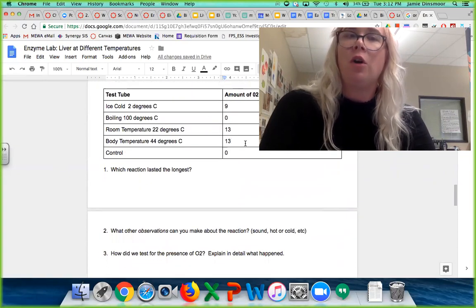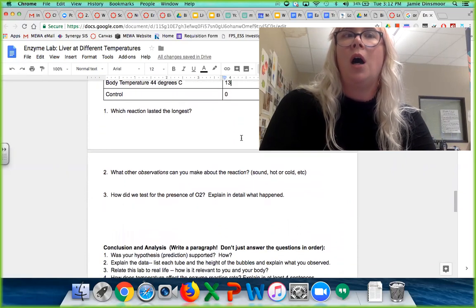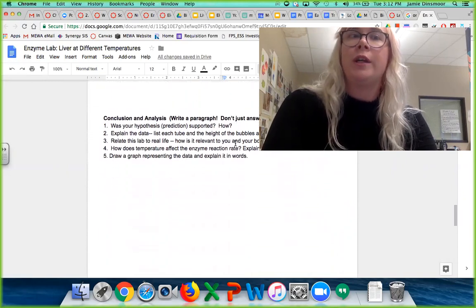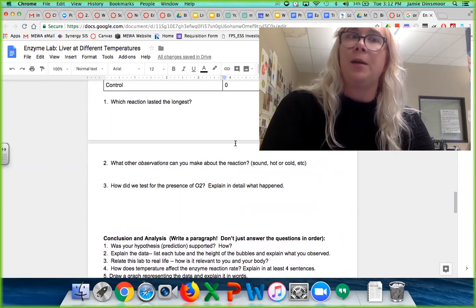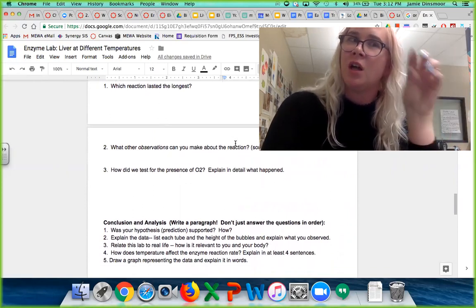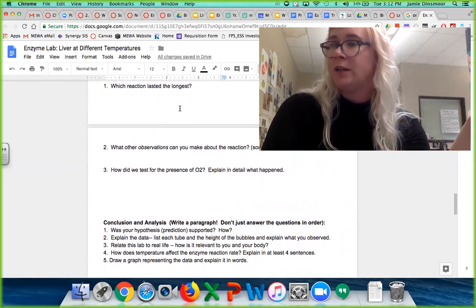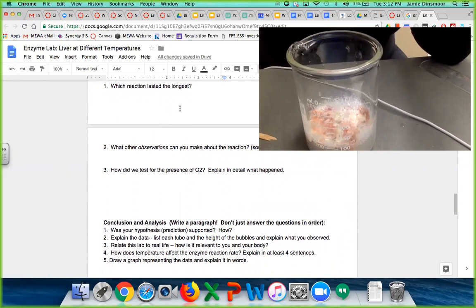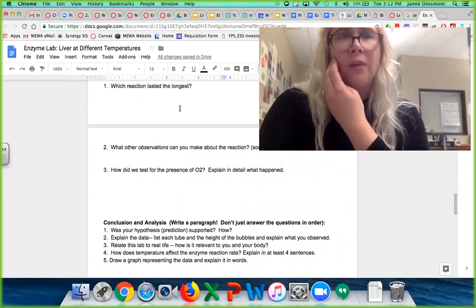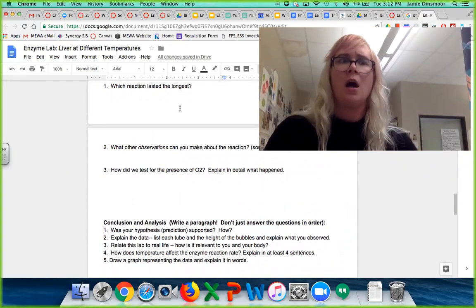The data, you should have all your data written down. And then you're going to work on these data questions, right, as well as the conclusion and analysis questions. Those you're going to do independently. So some of these are kind of hard to do because you weren't here in person. So I'm going to give you a few hints, right? For example, the reaction that lasted the longest might actually have been room temperature. That one went a little bit longer than the body temp one did.